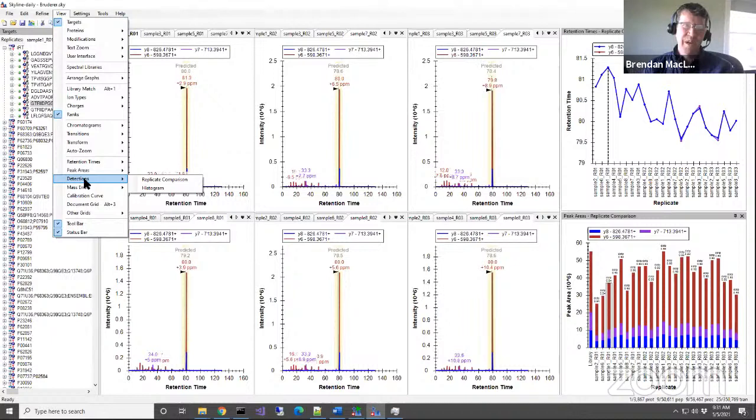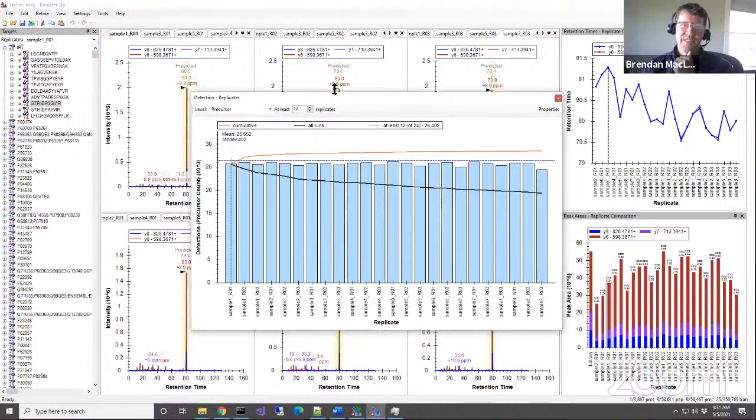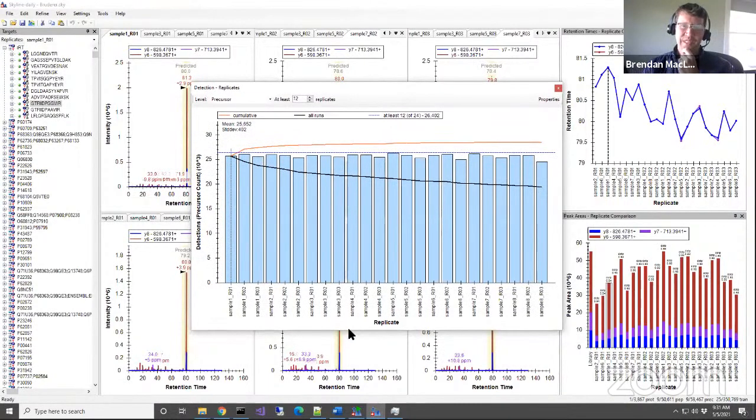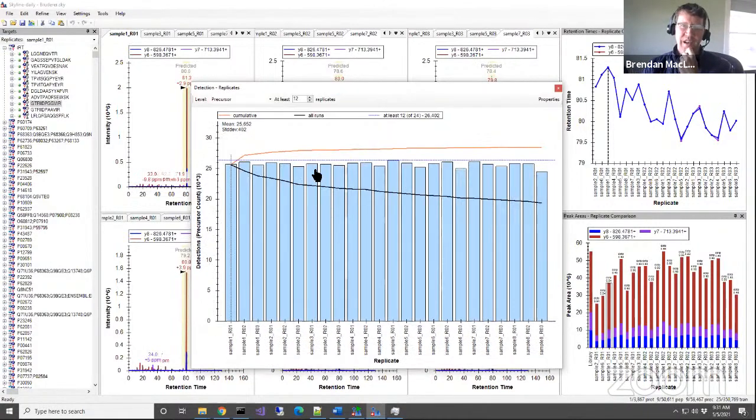So the next thing I wanted to look at was actually put in the last release by Rita Chupalov, and this is detection. So now we have another way of looking at the detections. This is a fairly common plot that was in a number of Aebersold Lab publications, certainly the Pan-Human Library cross-site.